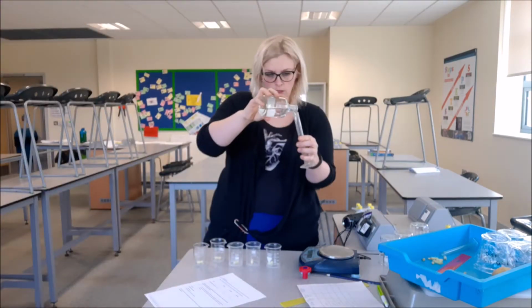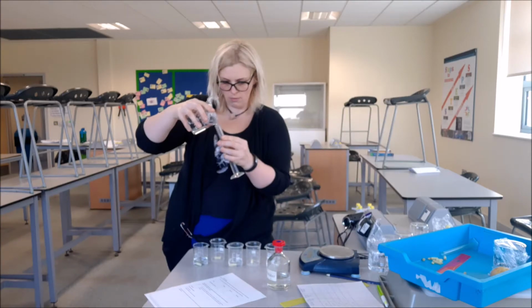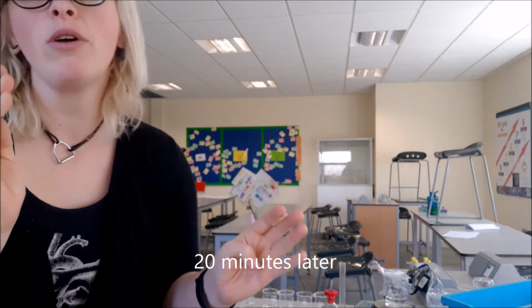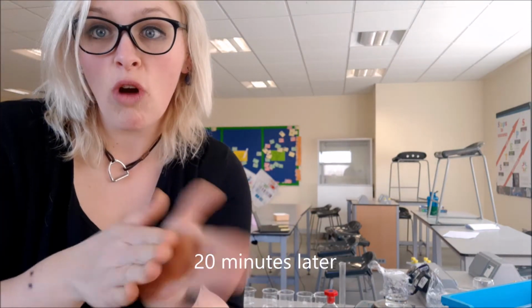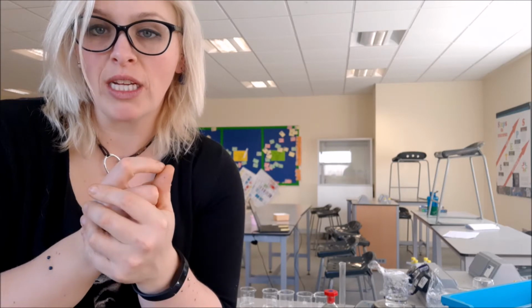When we're talking about liquids, always say volume, and we would use a measuring cylinder. Let's do this. But now what I'm going to do is remove them, and pat them dry just to remove the excess water from around the outside. That's a really important thing to do. And then I'm going to record their new masses and their new lengths.